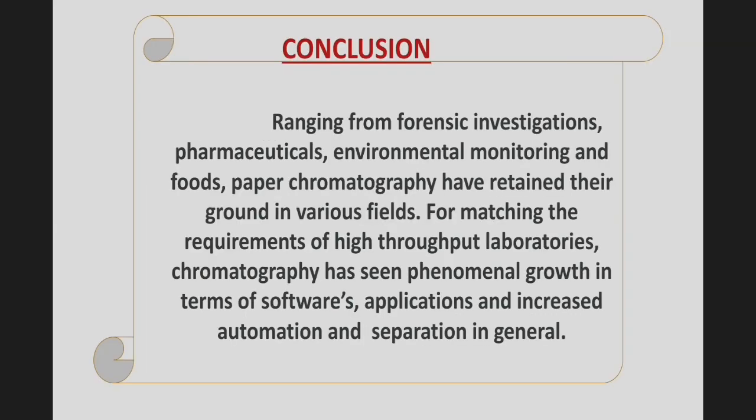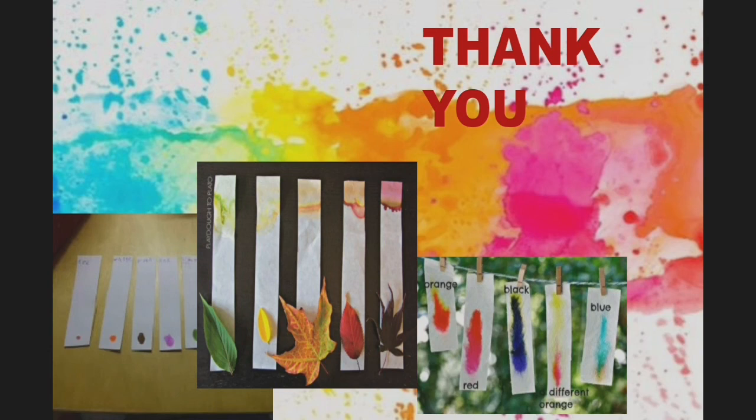Now we are going to conclude this presentation. Ranging from forensic investigation, pharmaceuticals, environment monitoring, and foods, paper chromatography has retained its ground in various fields. For matching the requirements of high throughput laboratories, chromatography has seen phenomenal growth in terms of software applications, increased automation and separation in general. So I hope you are a little clear on applications of chromatography.